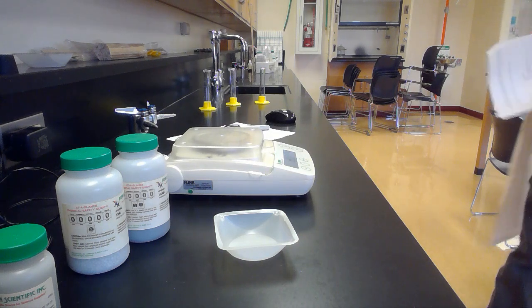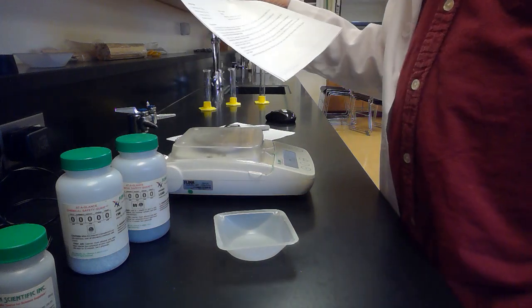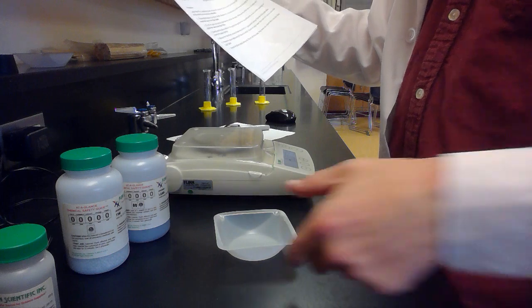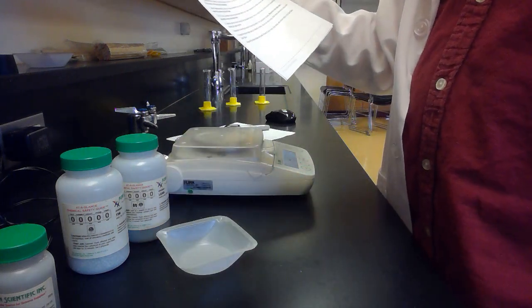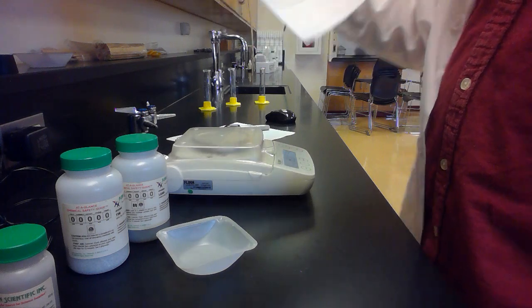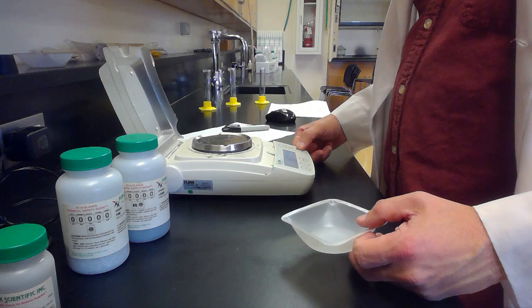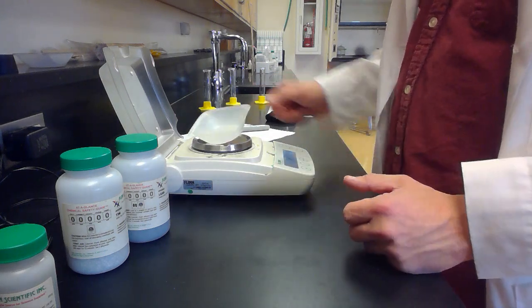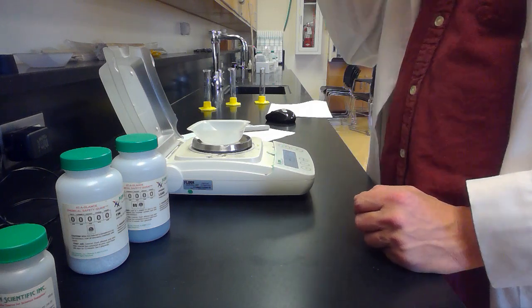So I got my lab handout here. I'm going to see what the instructions tell me to do. The first one, it says we're going to label 3 beakers or small containers with silicon, tin, and lead. And I have some little weighing dishes that we'll use. It says measure the mass of an empty beaker and record it in the data table. So this first one, I'm going to measure the mass. I have here a scale. And this is 2.47 grams.